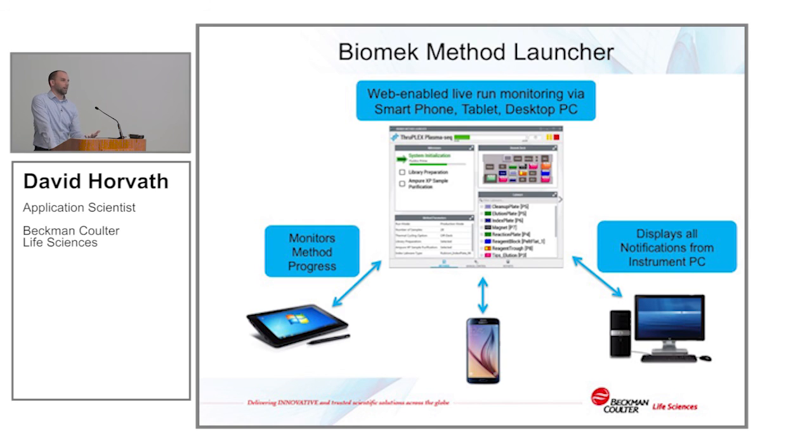So you don't have to be in the lab now and check on it every 30 minutes, pop back in to make sure things are going right. You can check it at your desk or go out to lunch and know that your run is executing properly.